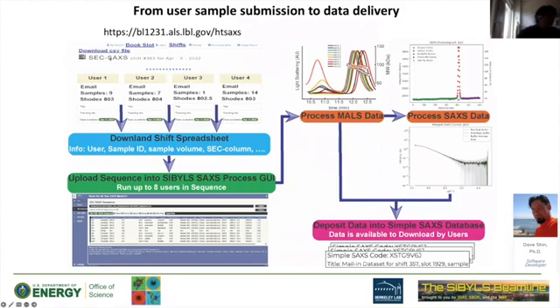You have the mailing page where you put your slot. You define which column you have, how many samples, the name, etc. This is downloaded directly to a GUI that Daniel already mentioned, and that's why this information is important for us. Please give us some information about the name and the volume. It goes straight to our GUI that starts the whole process of data collection for MALS and SAXS.